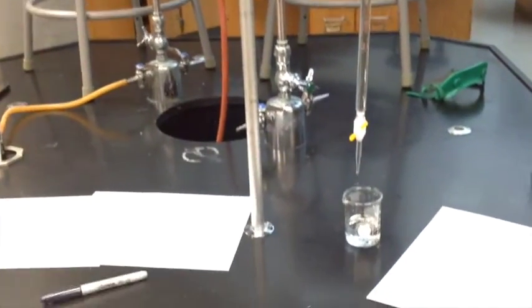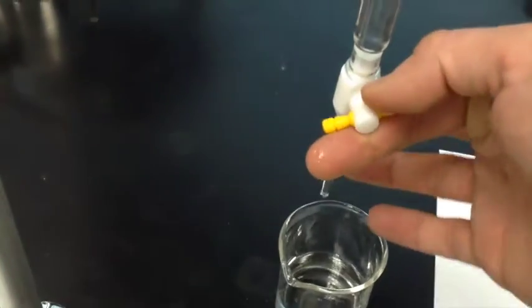You know, this is flowing, and it's very easy to control. And eventually, whatever we need to happen down here will happen. And at that point, you'll quickly flip the stopcock over.